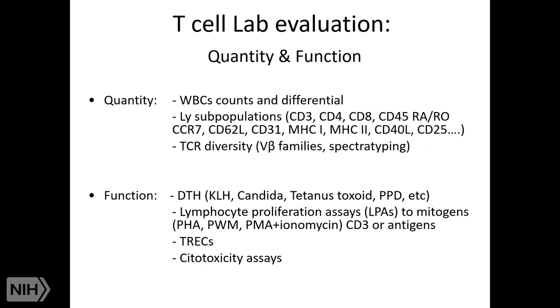Lymphocyte subsets we'll discuss. There are multiple of them, and we have CD3, CD4, memory, TEMRA, effector memory. We use different combinations that help us define different functions. These ones are the ones that we prefer: CD45RA are naive cells, CD45RO are memory, and we use CCR7 or CD62 ligand, again, as a marker of naivety or non-naivety of the cells.